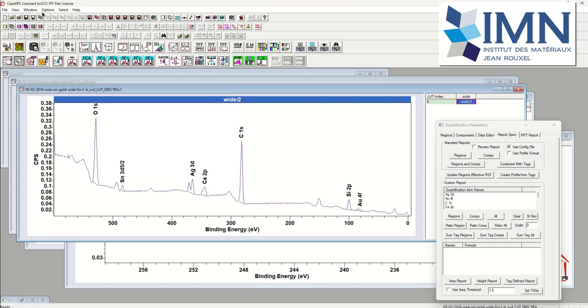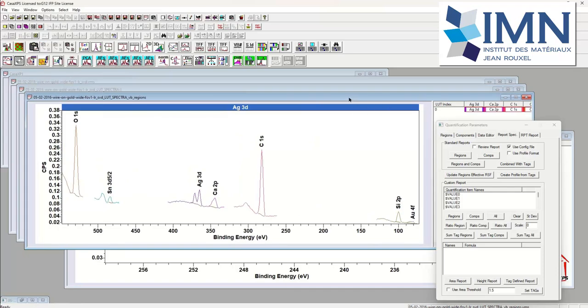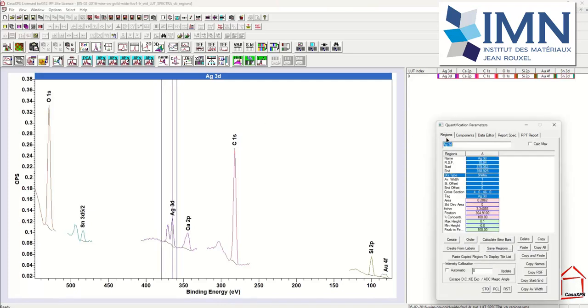So if we go back to our data, and this time I'm going to use a file that has been created from that survey measurement, in the sense that each one of these intervals of signal has been extracted from the survey measurement using the toolbar button that says spectra from regions. So I set up a set of regions on the survey measurement that extended beyond the interval over which I would like to define regions, and then using this toolbar button I could create from the survey measurement these individual VAMAS blocks representing the signal we see here.